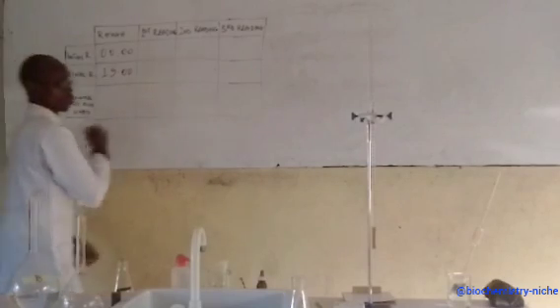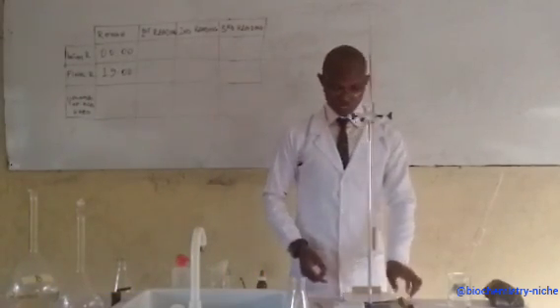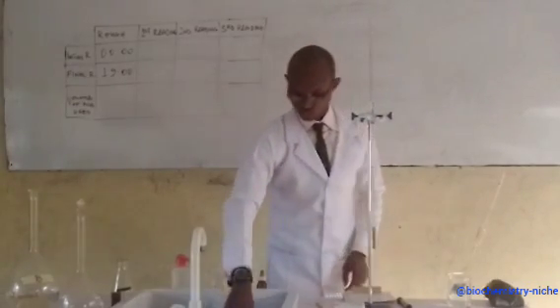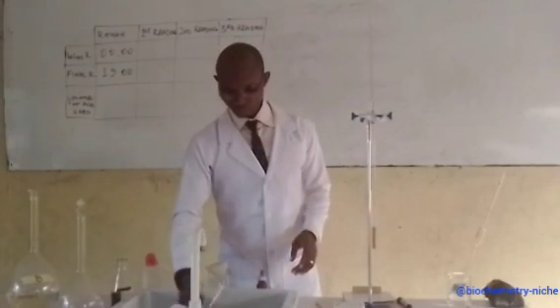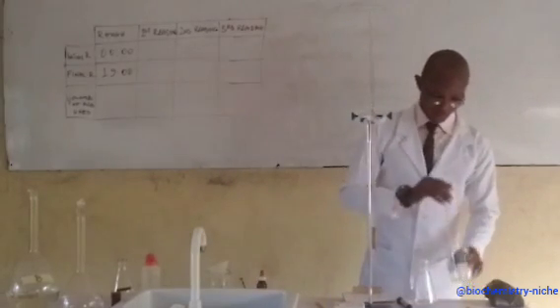So this is going to be okay. We'll come to that to actually talk about how to calculate it. So that is that about the first one. You can see the color that it has given us. So let us go to the second. Let me quickly rinse this. Right, I have rinsed.